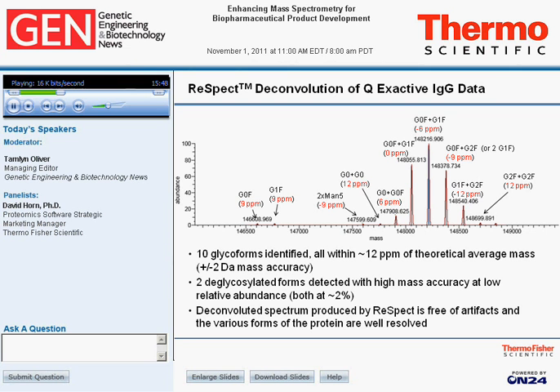And that mass accuracy was just as good for the peaks at very low abundance. So if we look at the peaks at 146,600, the G0F, G1F, there was some deglycosylation going on, it looks like. Those peaks are at a 2% level, and they're still sub 10 ppm. We can also look at the G2F plus G2F. That's also at a very low level, and that's 12 ppm. So we have very consistent mass measurement accuracy even for low abundant peaks. That was a surprise, actually. But we've seen this repeatedly from spectrum to spectrum, which I'll show in a moment.